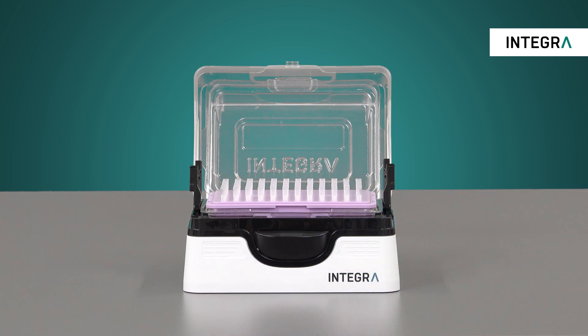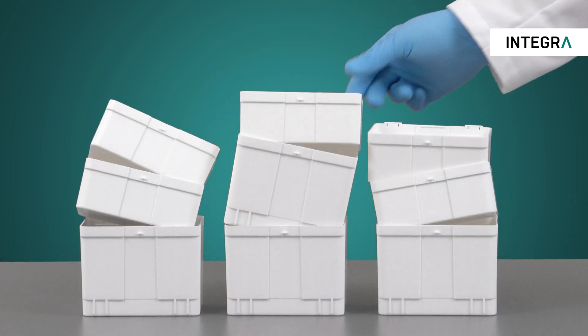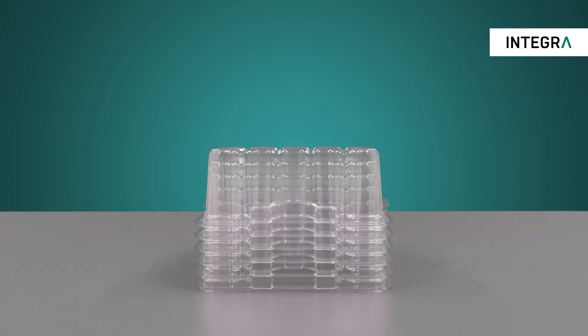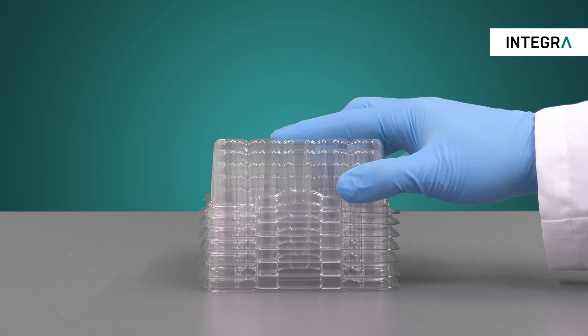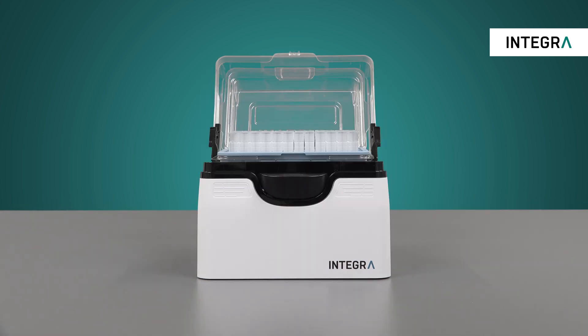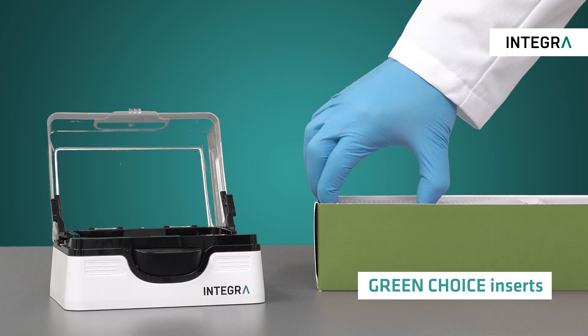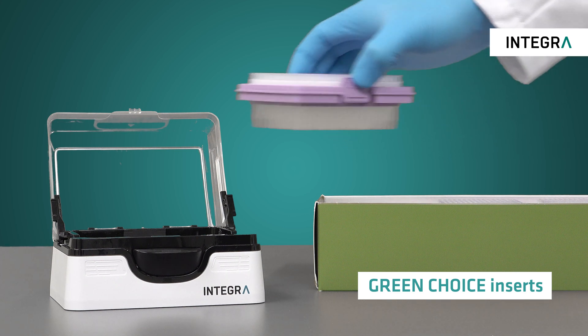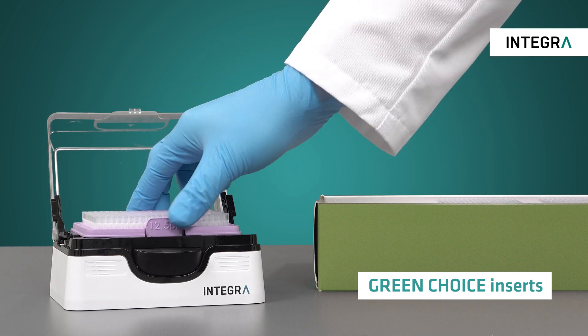Eco-Racks allow your lab to significantly reduce plastic waste from pipette tip racks, reduce required recycling bin space, and also offer the one-of-a-kind pop-top base for the sturdiest and most convenient grip tip pipette experience. The pop-top base can also be used with Integra's Green Choice inserts for even less plastic waste, since the tip rack is not needed.